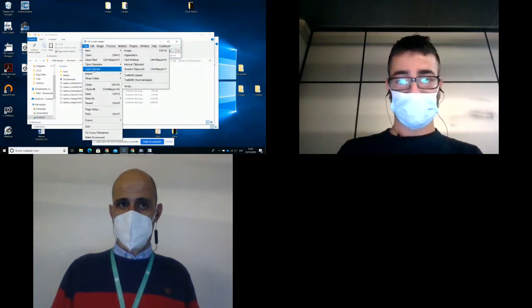This is a focal stack from the fibers. You can use the 3D project to get the 3D reconstruction. Or you can do the same with the fat tissue sample.